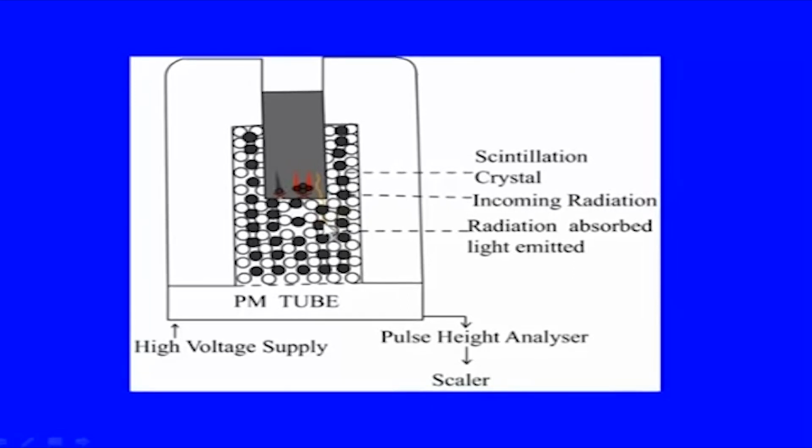On de-excitation they emit light, which is amplified by the photomultiplier tube and finally converted to an electric signal to be measured. So, in solid scintillation counting, you have to have these crystals of fluor very close to the radioisotope. It is a very useful technique in many biological and biotechnological applications.